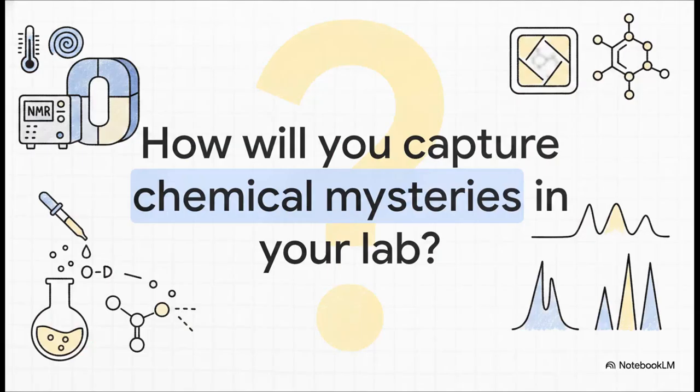So, as we wrap up this molecular detective story, I want you to remember this core principle. Your NMR spectrometer is, in effect, just a camera with a slow shutter. Truly understanding that gives you so much power in the lab.